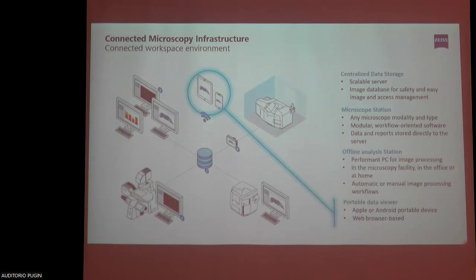And what is really strongly used, especially in the Asian countries, is that you view your data and your data processing results with mobile devices. So you're basically at home or in the tram, etc., and you take a look at it and maybe share the pictures. You send it to your collaborator, you give permission to your boss and say, hey, look, this is the outcome right now. What do you think is good? And then they could maybe use their smartphone or tablet to do some annotation and say, oh, maybe look at this region when you rescan or re-image your sample.